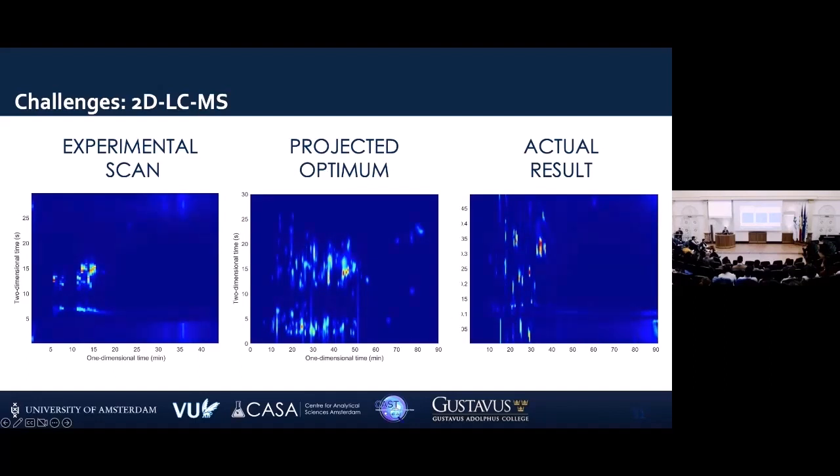So that's of course the other thing. You can optimize all of these things as much as you want and tell the algorithm, well, give us more peaks, so get a better separation. However, I don't know how many of you are familiar with the breakthrough phenomenon. You get analytes that basically do not interact with the column. All of these peaks are the same as these peaks. So this over here is a breakthrough from these peaks. This is the real separation, and this is the stuff that is suffering from the breakthrough effect. Peak splitting effects that you do not want in chromatography.